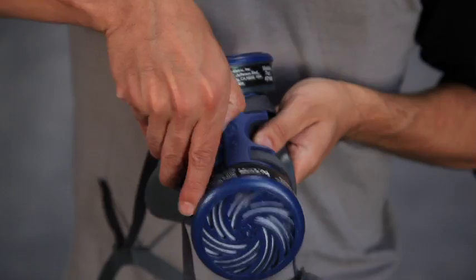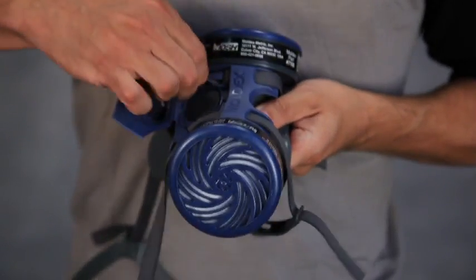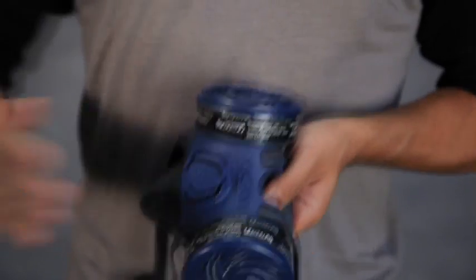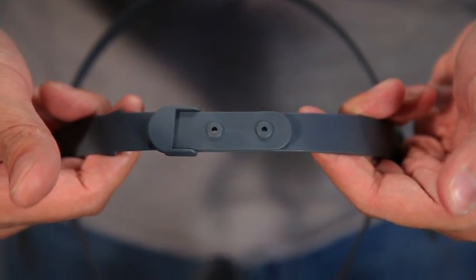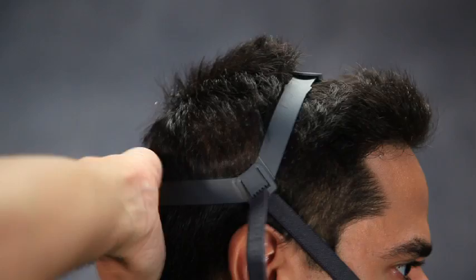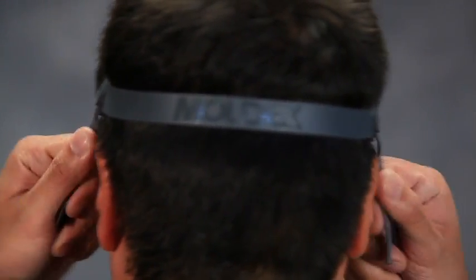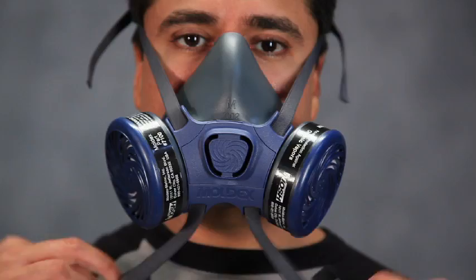The Moldex 7000 also offers a drop-down mode option. Open the valve cover by pulling up on the latch. Pull the straps out from underneath the locking tabs in the strap channel, then close and snap shut the valve cover. Adjust the head cradle size so it rests comfortably on the crown of the head. Attach the bottom straps directly against the back of your neck, then position the head cradle on the crown of the head. Tighten the top straps first and then the lower neck straps to obtain a very snug and leak-free fit. To remove in drop-down mode, unbuckle the lower buckle and drop down the mask. Fold the head cradle at the living hinges to lay it flat and comfortably behind the neck.